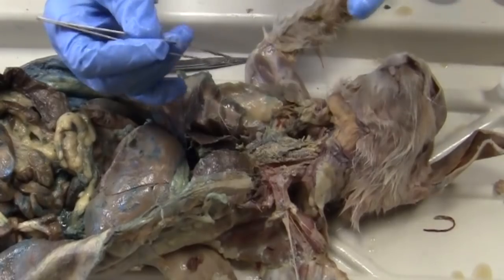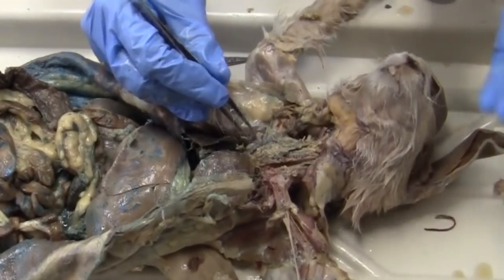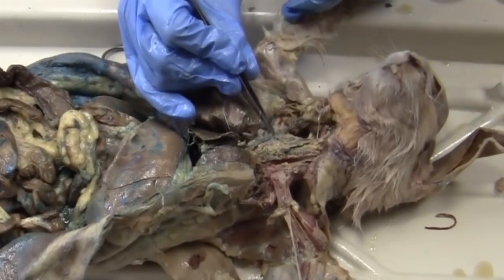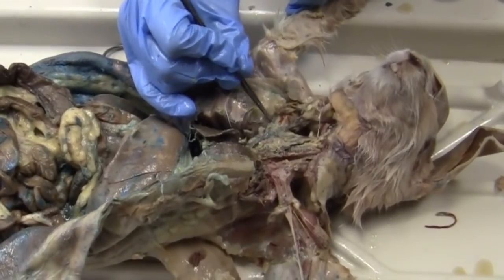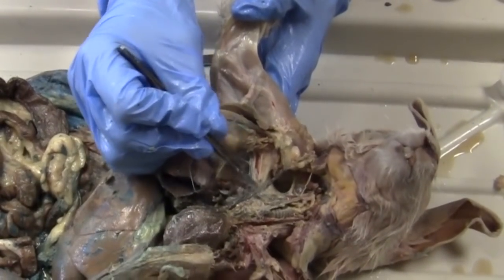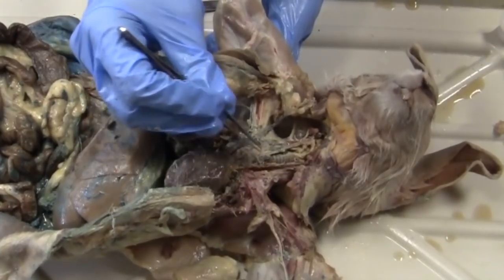Now, off of the brachiocephalic vein, it branches once again. So as it's coming up, it branches here. So I have the right external jugular and the right subclavian. So here, and actually you can see where it branches and comes over here, but I accidentally cut that.